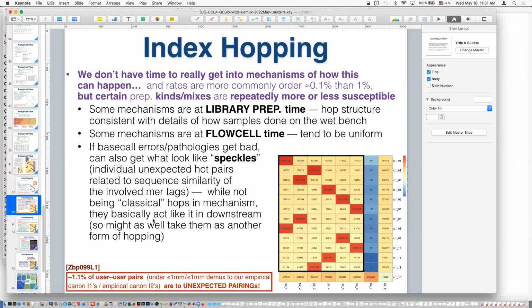Now, suppose you've got one of these cases where the indel errors actually have a high systematic pattern that bridges that gap. Well, now you've got some of this guy bleeding into here or this guy bleeding into there, and the representation ratios are different. That's even worse, right? Maybe this guy is 10 times the size of this guy. Now it's even more possible. Well, what's that going to look like in this view? It's going to make a hot square. Right? It's going to start.